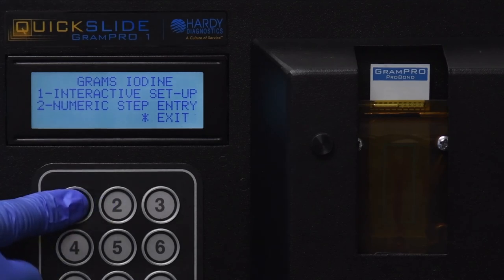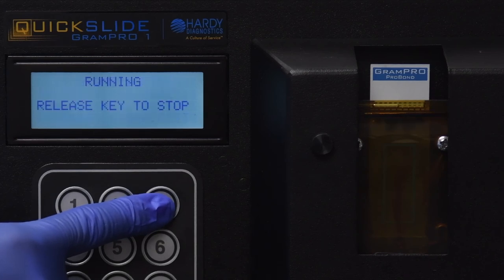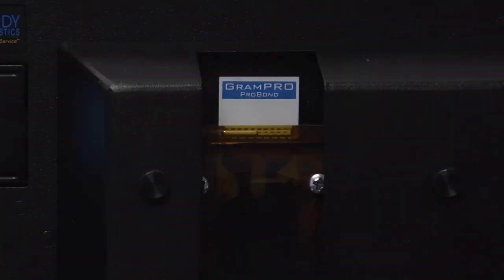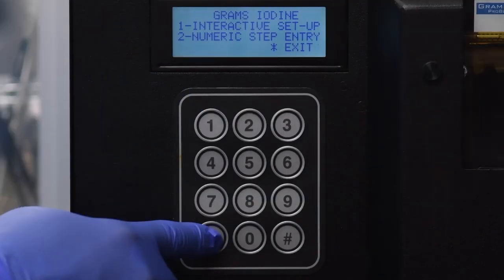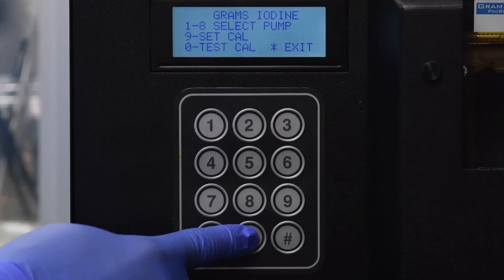Press 9 to select Set Calibration, press 3 to select Fill. Before proceeding, place a blank slide in the cuvette. Once the slide is ready, press 1 to select Interactive Setup. Press and hold 3 to select More until you see grams iodine fill the cuvette. Let go when you see the fluid levels reach the top two Phillips head screws on the cuvette.